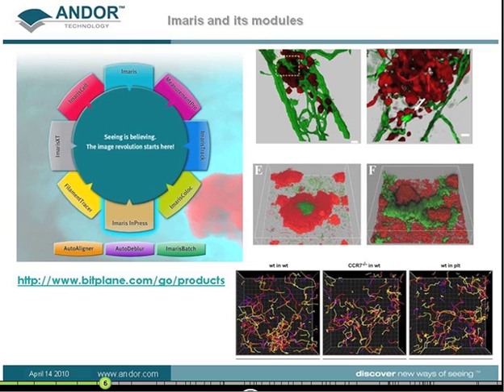And then if you look up here on the right-hand side of the slide at the top, we have a visualization or reconstruction of a zebrafish heart during development, and then a zoomed-in focus on the heart as it develops at the single-cell level. This is a classic application for Imaris, and through allowing visualization, characterization and tracking of individual cells through development, we can get an idea of the fate and the environmental impact on individual cells as to how they eventually become differentiated as contributors to organ development and so forth.